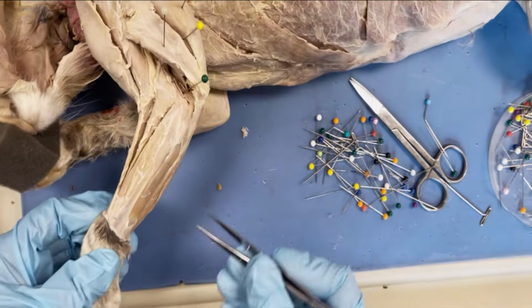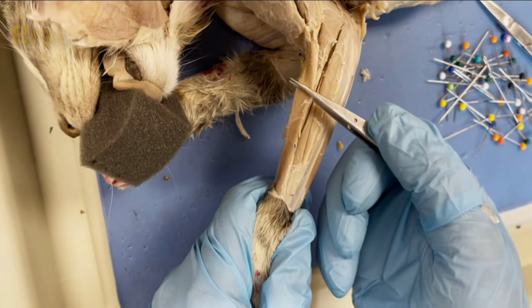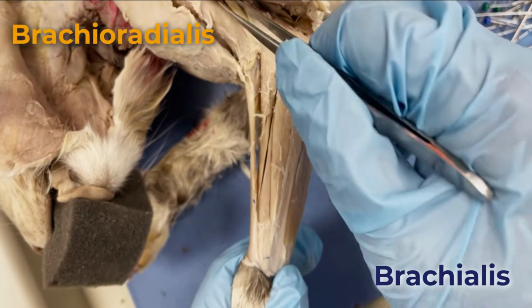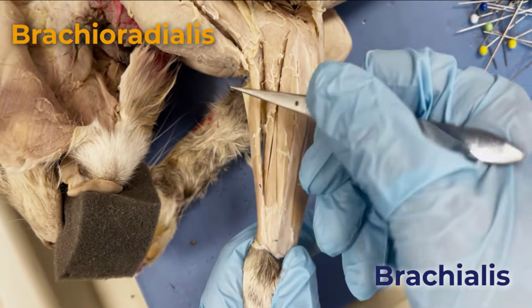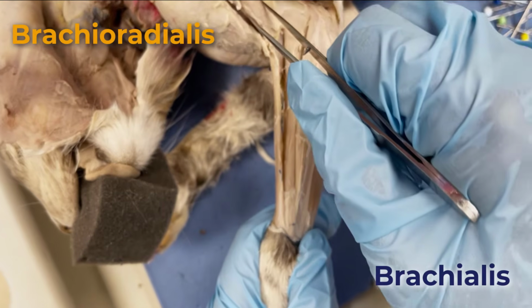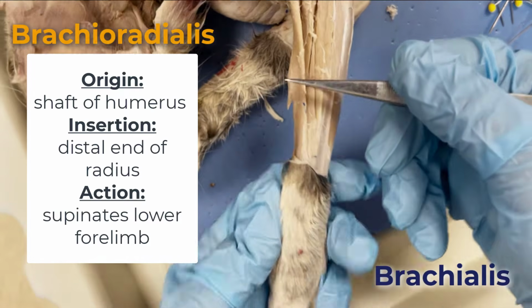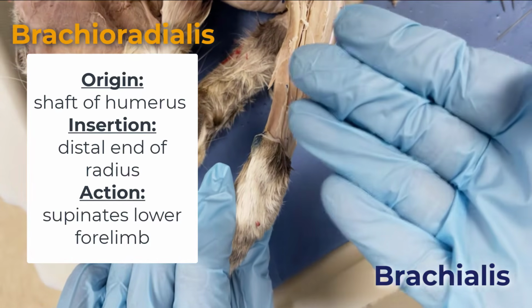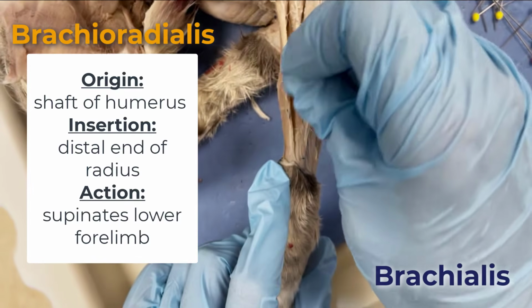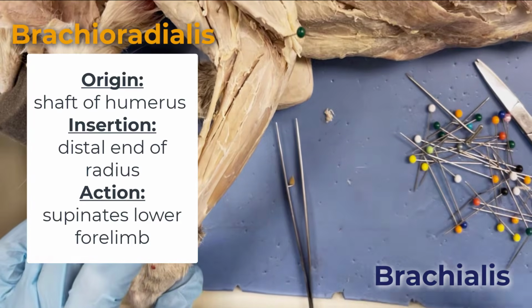Coming down here to the front part of the forelimb, we're going to go from anterior to posterior, is our brachioradialis right here, which is sort of connected to the brachialis muscle right up in here. So if you can find brachialis, sometimes when you're removing fascia and there's blood vessels that run along here, you end up tearing the brachioradialis. But that comes from brachialis to brachioradialis. Brachioradialis helps supinate. So as that's contracted, no, I can't really do it with this cat. It's going to supinate the paw there. So we're going to get brachioradialis there, and brachialis right there.